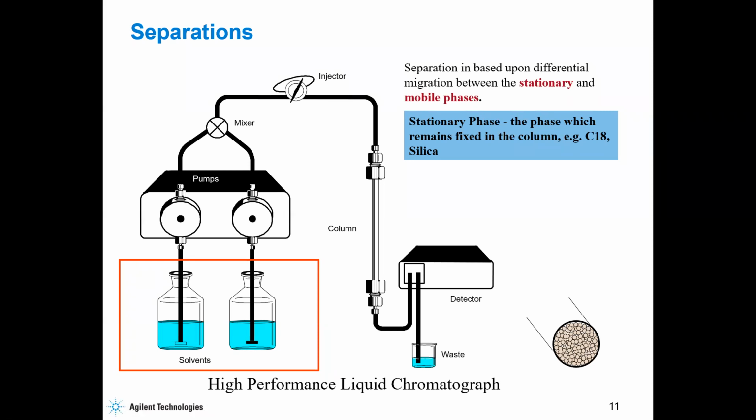So almost all HPLC detectors are non-destructive because you can collect a fraction of your separated sample and retrieve it, and maybe do thin layer chromatography, or further elucidation. You can always do that with it. Do you understand? But for FID, there will be a destruction, you can't recover it again. That's the difference.